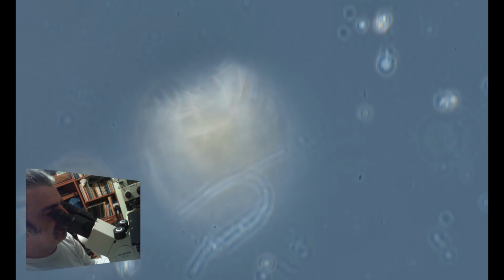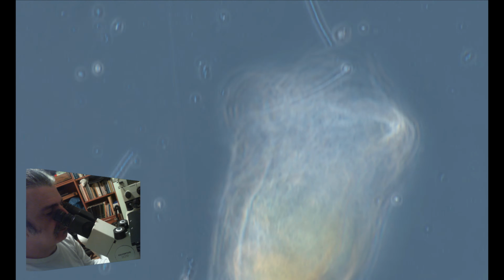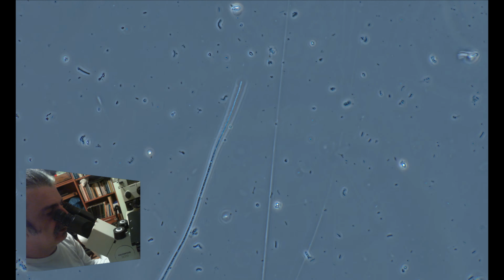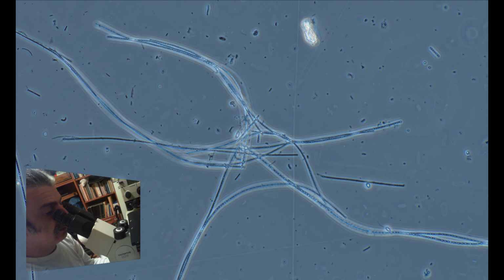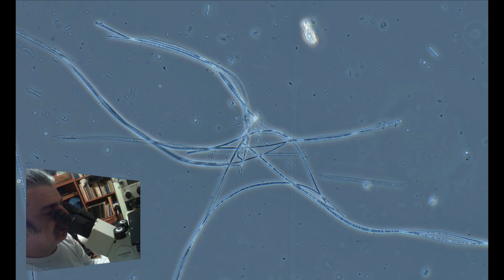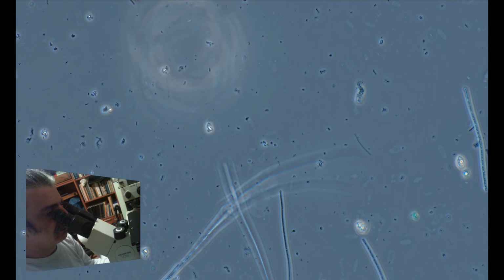Ooh. I think that Euplotes got tangled in something. And all those fine strands that we see scattered around are cyanobacteria, which is kind of a mix between bacteria and algae. Let's see what else we can spot with phase contrast.